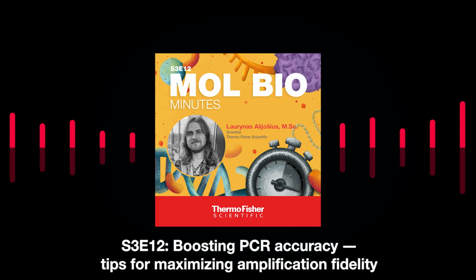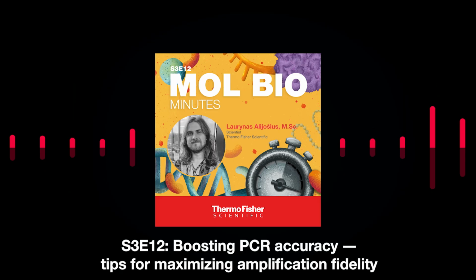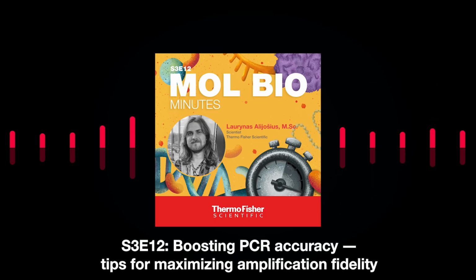So if you would like to avoid all this, in the notes of this episode, you can find tools for such applications like primer designing, or to calculate the temperature of your primer melting conditions. These tools could help you with this primer designing and planning.